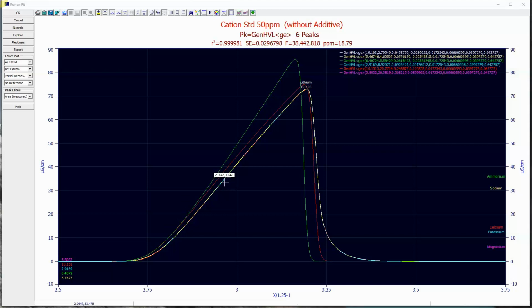We note that the IRF is considerable, especially in the tail. And this is also a good point to note that we have never seen an analytic peak in an isocratic separation where the IRF was negligible.